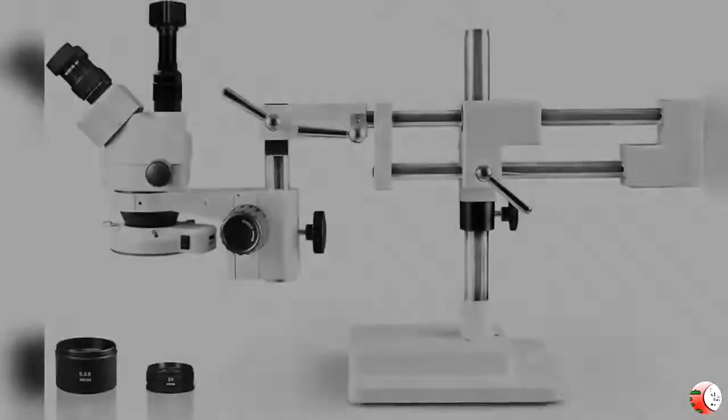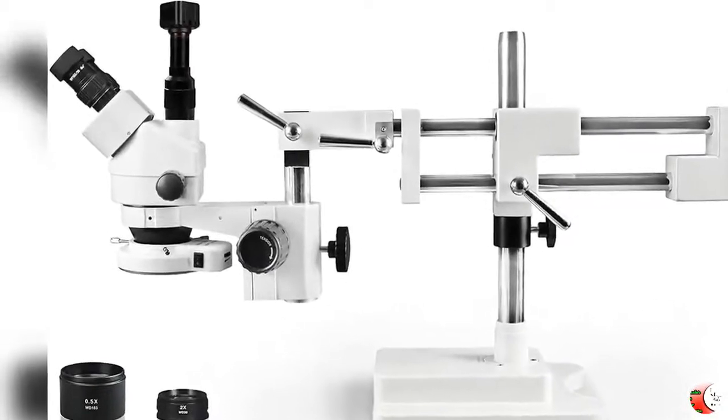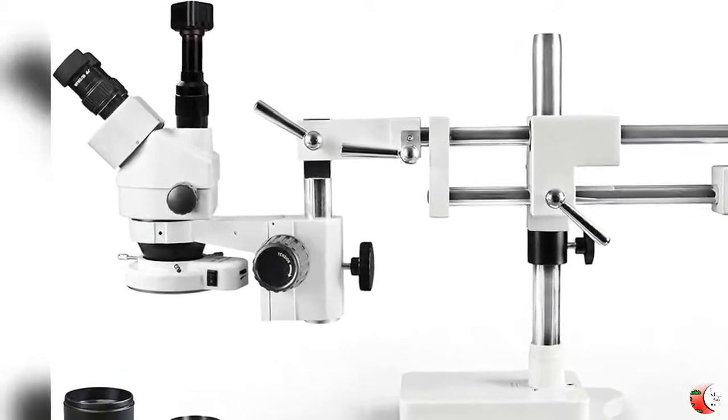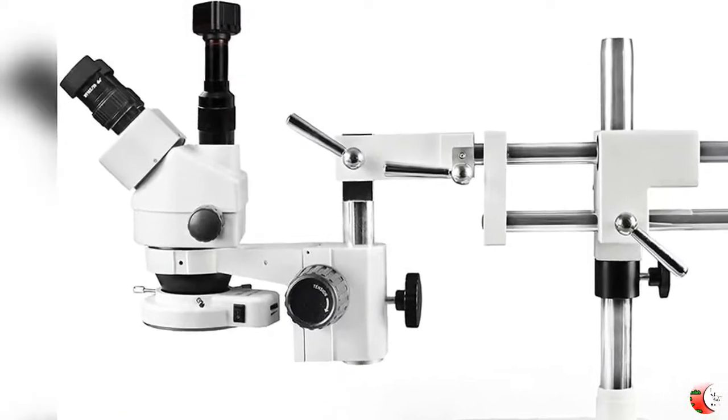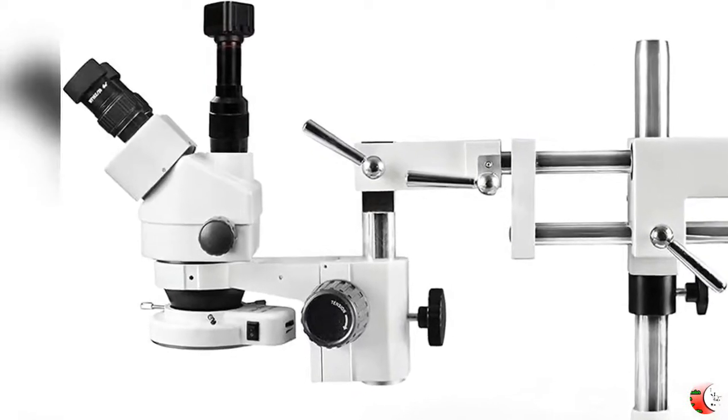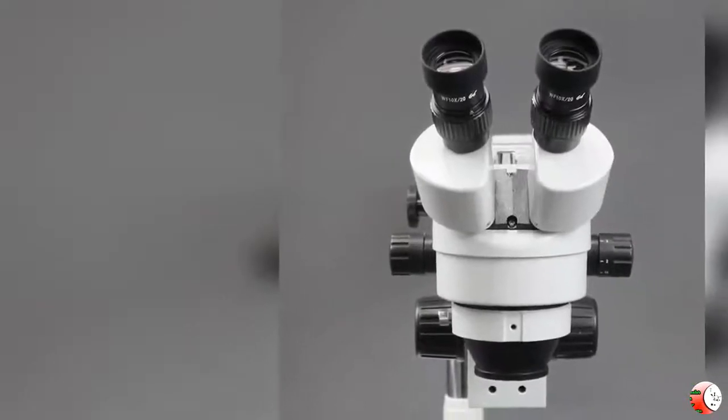10x Wide Field Eyepiece, 0.7x to 4.5x Zoom Range, 7x to 45x Magnification Range, Double Arm Boom Stand, 5MP Wi-Fi Digital Camera.